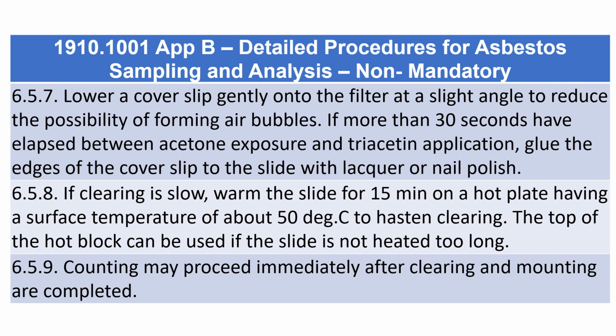6.5.7. Lower a cover slip gently onto the filter at a slight angle to reduce the possibility of forming air bubbles. If more than 30 seconds have elapsed between acetone exposure and triacetin application, glue the edges of the cover slip to the slide with lacquer or nail polish.